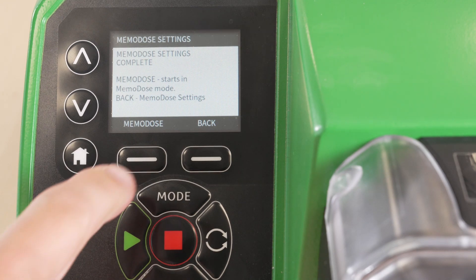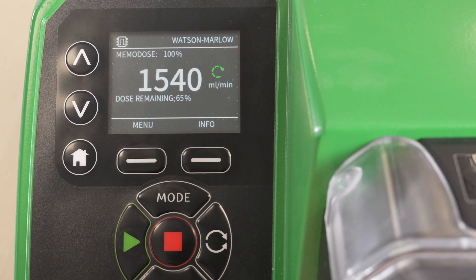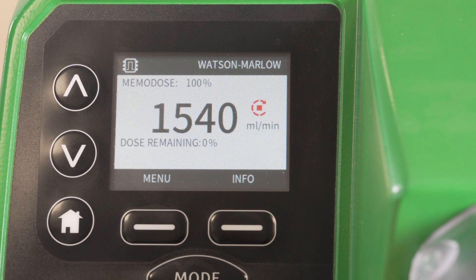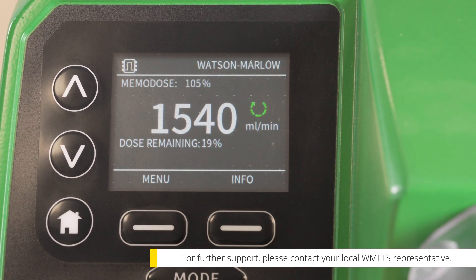Select Memodose to enter dosing mode. The dose can be triggered by the start button or by one of the available dispensing accessories compatible with your pump, such as a foot switch. To apply adjustments to your Memodose, you can use the arrow keys to apply a percentage increase or decrease to the saved dose.